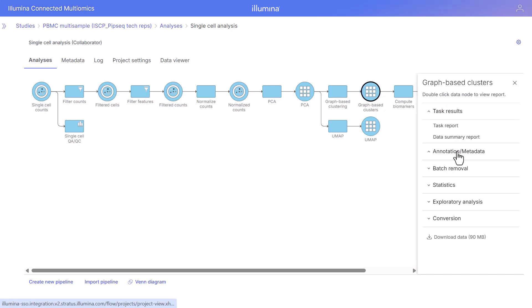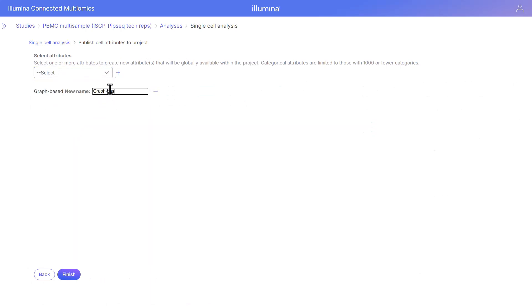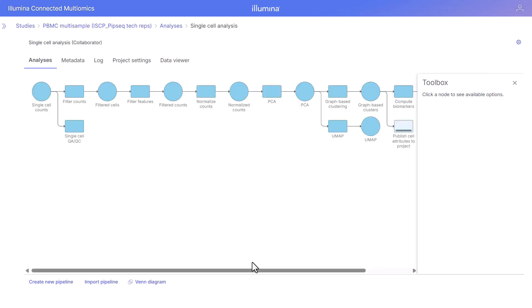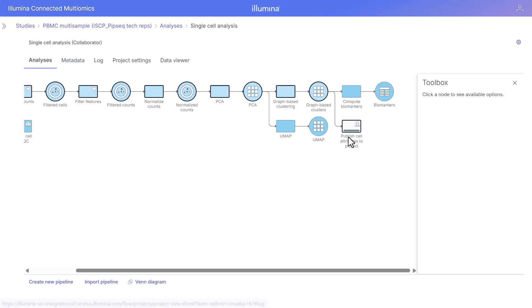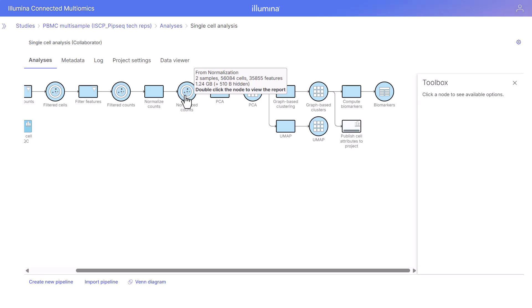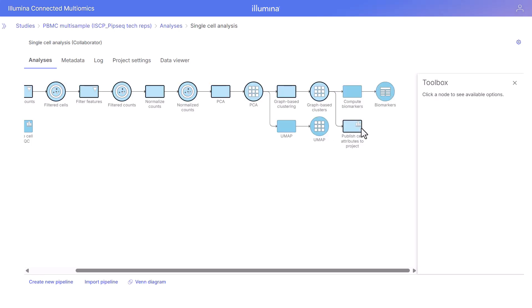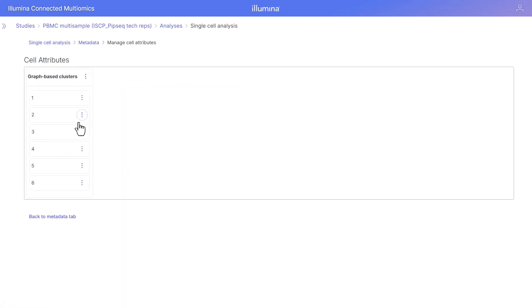We're going to queue the publish cell attributes to project task from this node, select the graph-based clusters attribute, give it the name 'graph-based clusters', and click finish. This publishes those cell-level attributes to the project. When this completes, we'll be able to locate them in the metadata tab under cell attributes, and they'll also be available for downstream tasks like differential analysis on the normalized counts node.